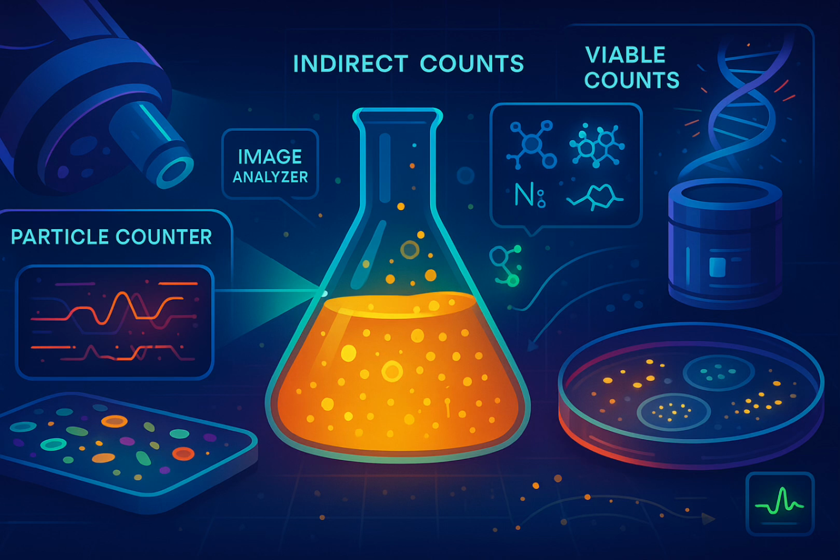But if the cells are naturally fluorescent, or if you've stained them with fluorescent dyes, they glow when the laser hits them. Different detectors measure that fluorescence. So you could potentially count different types of cells if you stain them differently. Precisely. Modern machines use multiple lasers, multiple detectors. You can count different populations, maybe even look at cell health with certain dyes. Some can even physically sort the cells. Sort them. Wow.